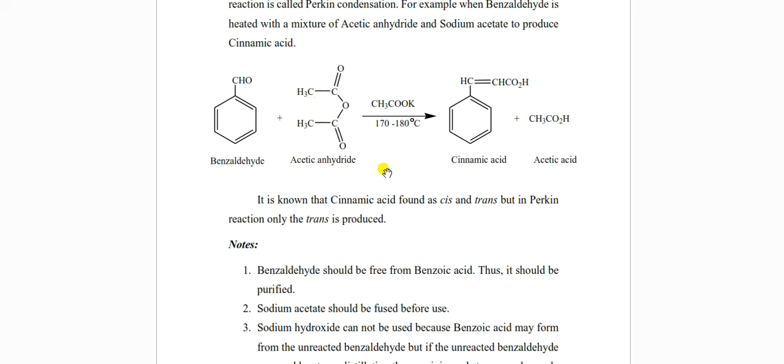So the conditions for this reaction are reflux heating and dry conditions. We have to be sure that there are no traces of moisture or H2O in this reaction, to avoid losing our starting material, the anhydride, because the anhydride will hydrolyze if there is any moisture or H2O in the atmosphere, in the glassware we use, or with any materials of the reaction.